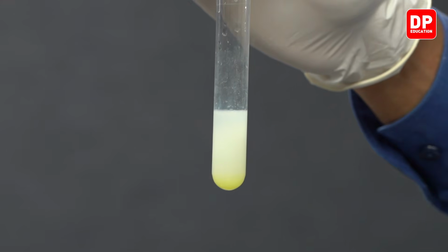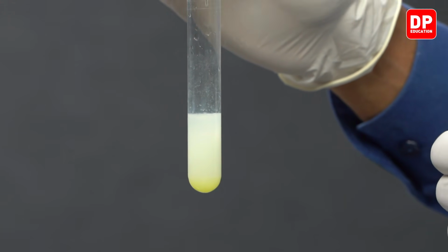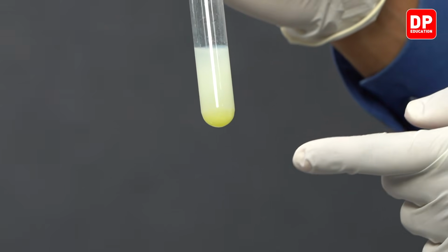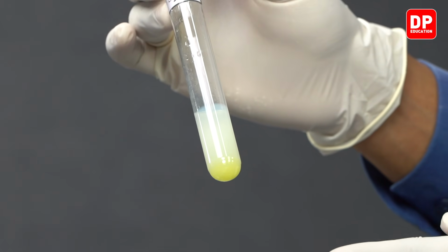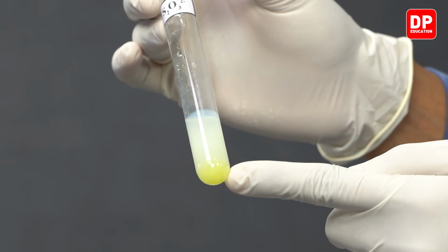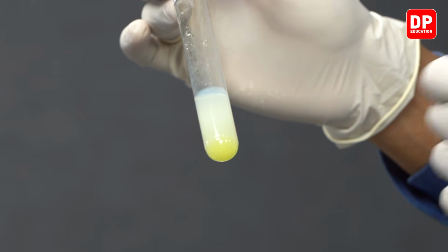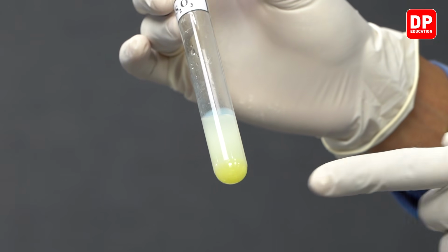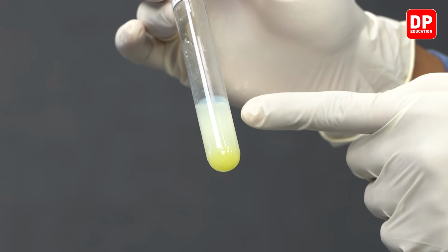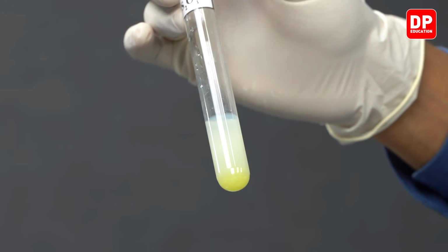And at that point, sulfur was dispersed throughout the medium and we couldn't clearly observe the color. And now it has been about 10 to 15 minutes and you can observe the sulfur has now gotten collected at the bottom of the test tube, and we can very clearly see a yellow color precipitate that is present here due to solid sulfur getting collected at the bottom of the test tube.